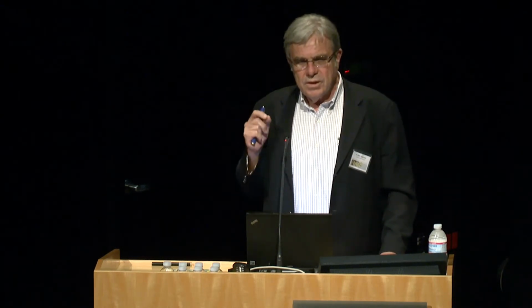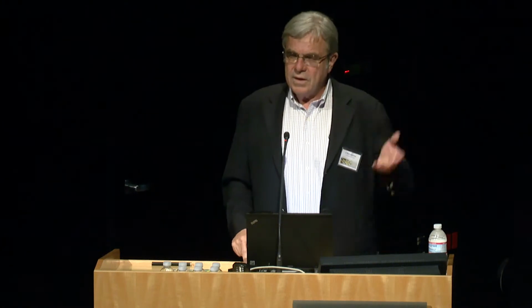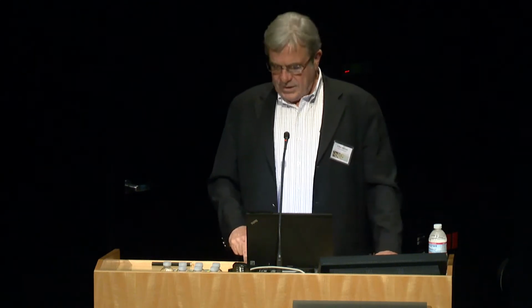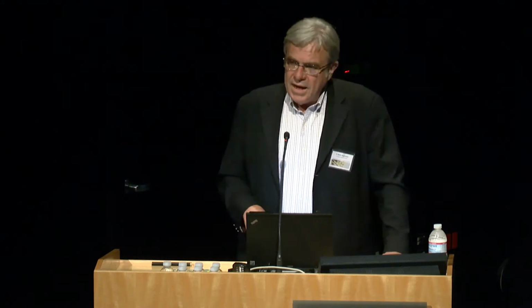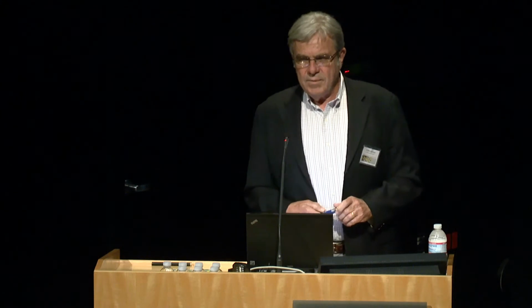But things have developed a lot over the years, and so we have a technique now that can really monitor neurotransmitters and metabolites during behavior, and that's kind of the goal of a lot of our neuroscience sensors. But in addition, now we can start combining this technique with other techniques so we can get a more complete picture of what is actually going on in the brain. So the way we go about monitoring neurotransmitters is by the technique of electrochemistry, a classical technique that you all probably studied in freshman chemistry.